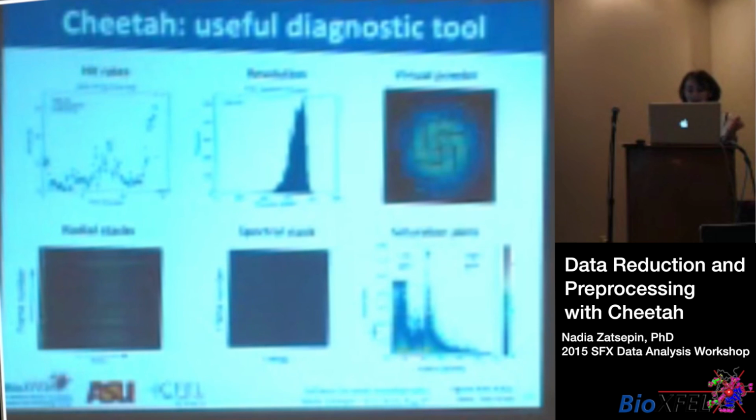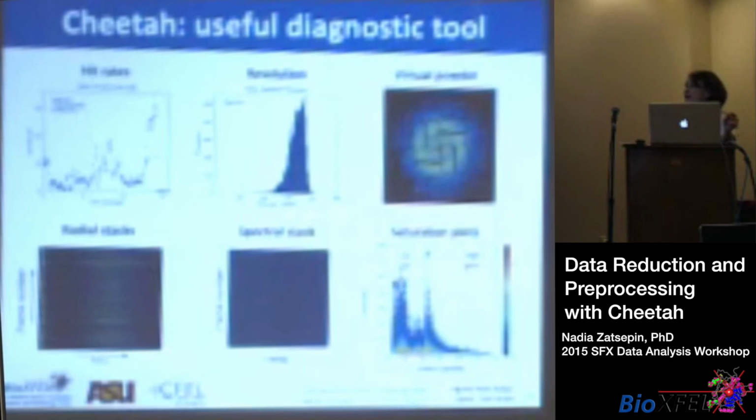So these have not been scaled. This part right here, this sharp divide, is simply because these numbers need to be multiplied by a factor of 7. So that's very, very useful as well.